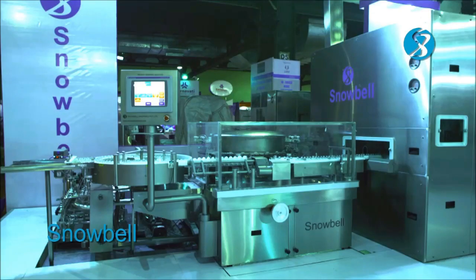This machine is set up with 15 gripper blocks with four gripper arms per block to give you an output of 120 vials per minute for 20 ml tubular vials.